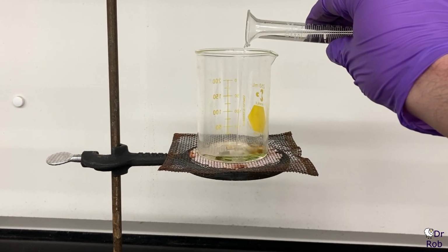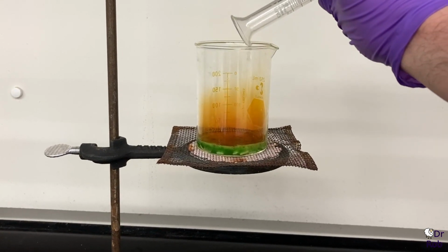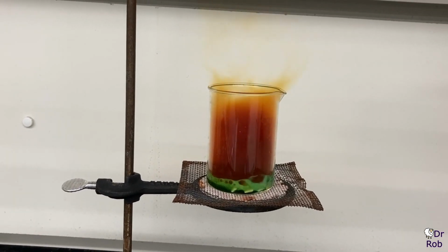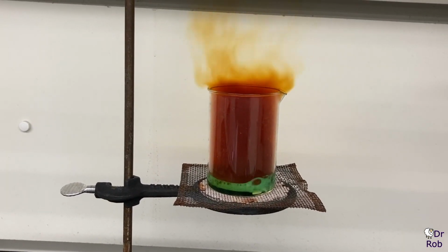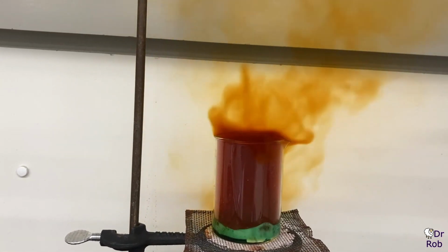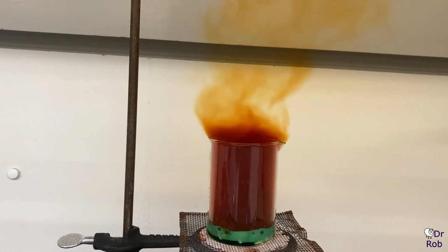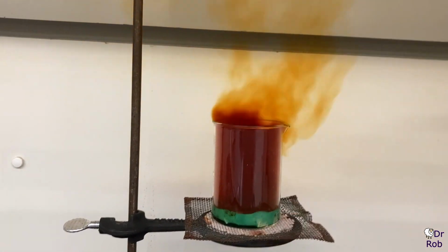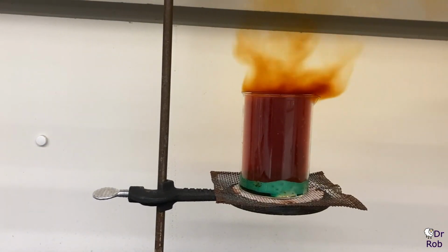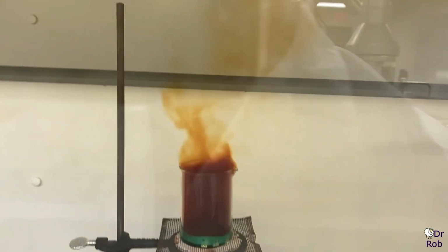As soon as we add it in, the reaction starts immediately and it starts producing the very brown, very unpleasant looking nitrogen dioxide. And you can see at the bottom all of the gas being produced as the brass dissolves. Really, it's the copper dissolving and breaking apart. And you can see the benefit of doing this in a fume hood is it really carries that gas away. You also see that the solution starts out pretty green. You can kind of see the greenish color there at the bottom of the beaker.